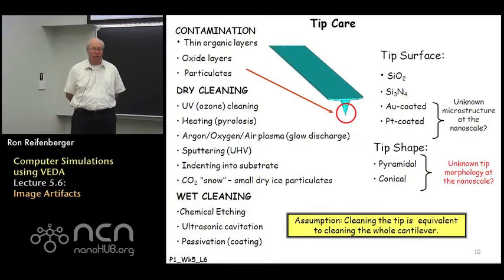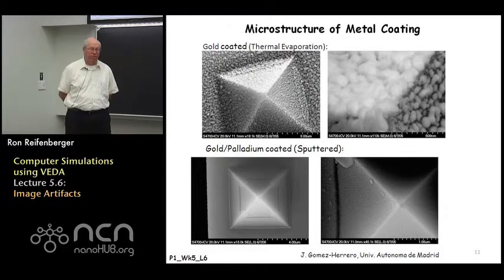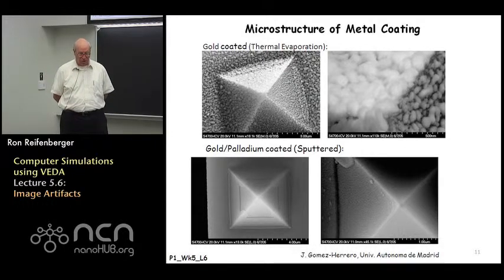images. And I just illustrate that in the next slide where I compare the microstructure of metal coatings for a tip that's been gold-coated using a thermal evaporation technique and a tip that has a gold-palladium coat that's been sputtered onto the tip.